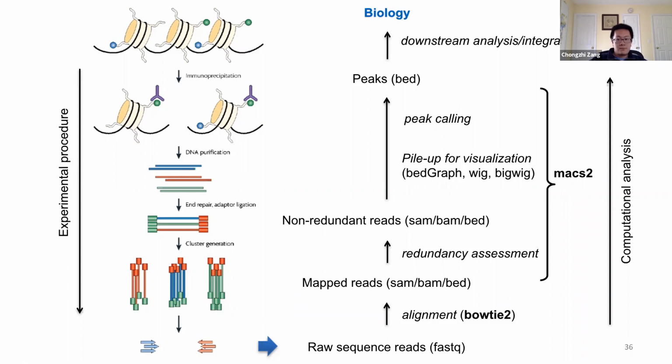Questions? Can I ask a stupid question? I was just wondering, how do you differentiate between a PCR amplification of a certain sequence and the height of the peak in a certain region? Do you understand what I'm saying?